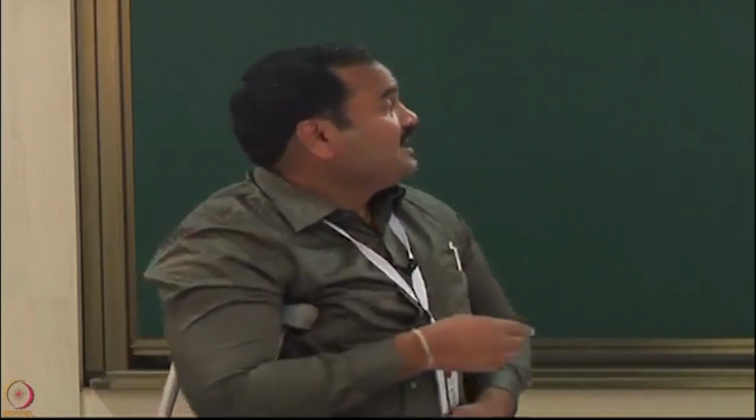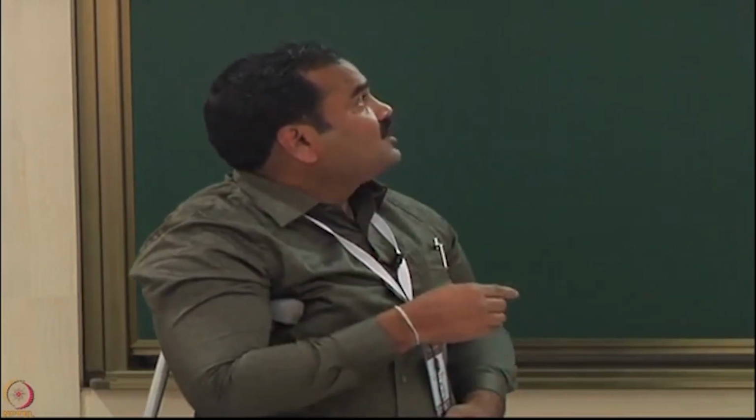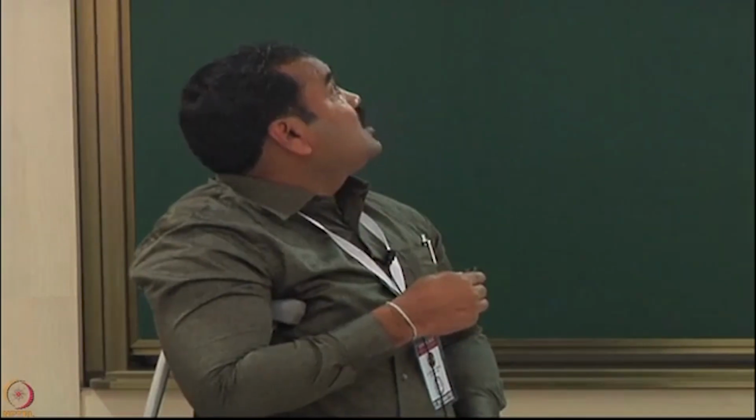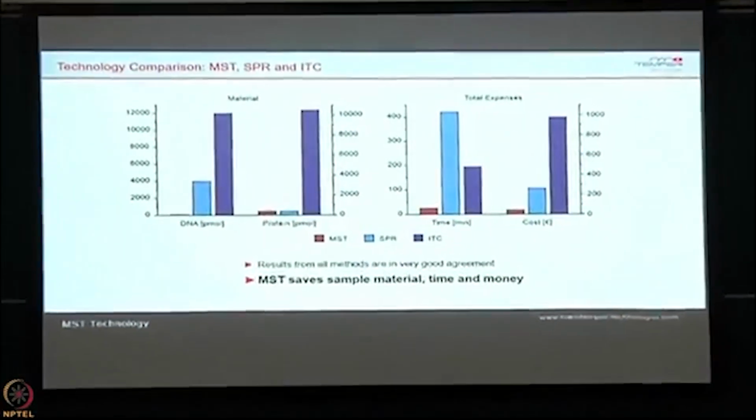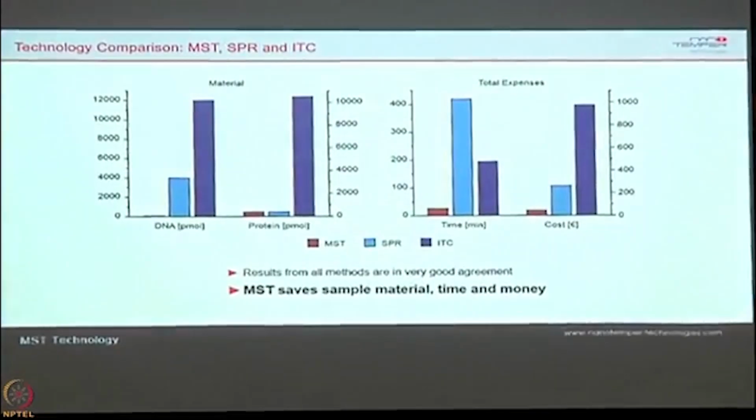This has been highly worked out with all 3 experiments. As you can see here, the cost is almost 1/10 of what we generally spend for an SPR and other assay experiments. So maybe people working with SPR still might have some questions. You can still feel free to ask me.